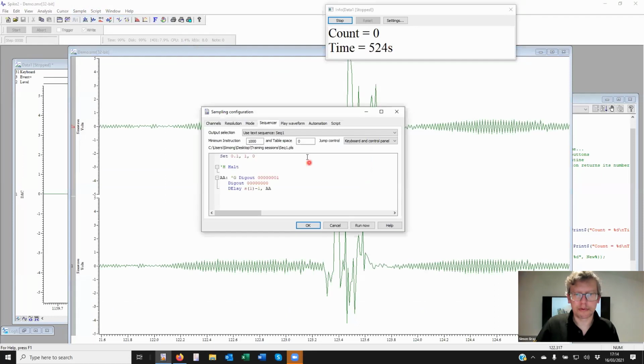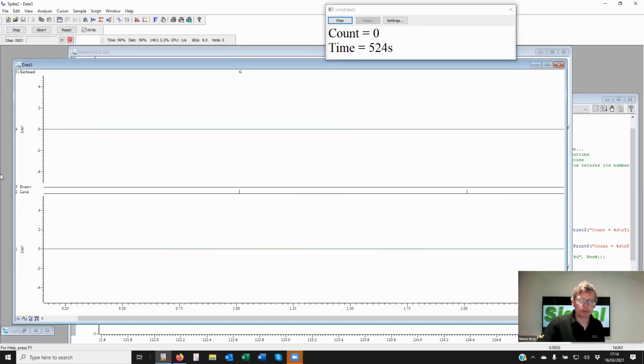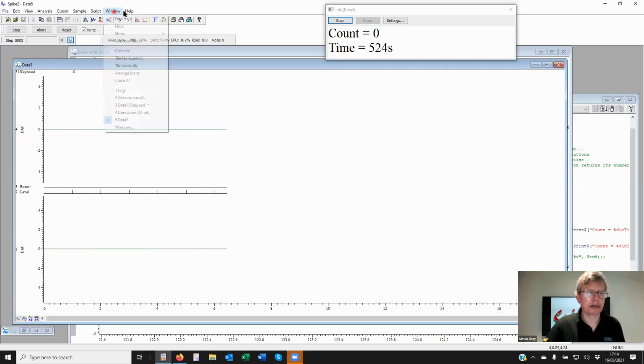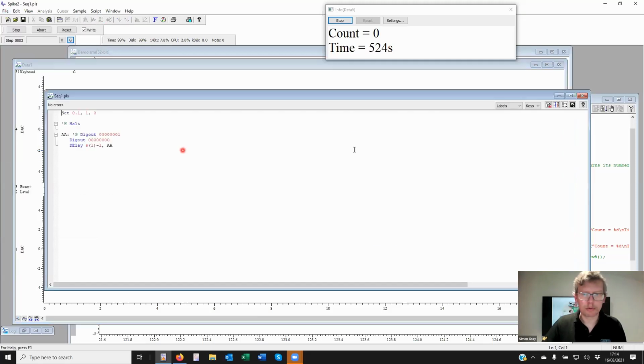Let's go to the configuration. Let's set this to 0 and run now. Start. Outputs are happening, that's fine. I now wish to modify that sequence a little more. So where is it? Show sequence 1. That's the current output.